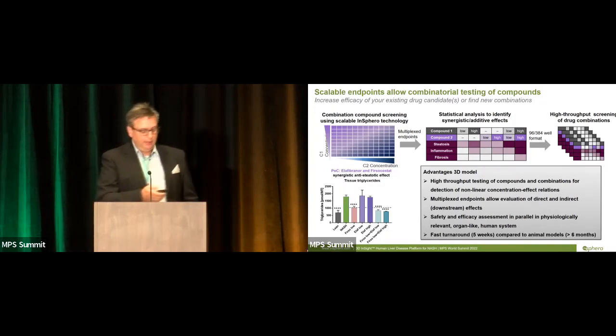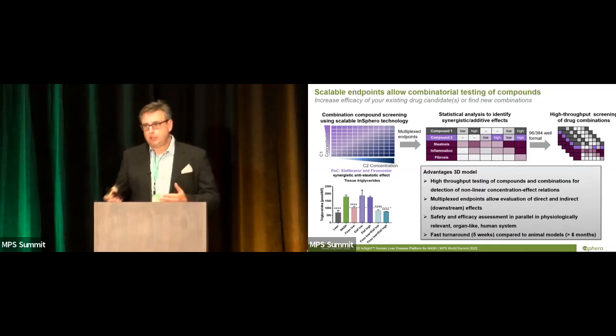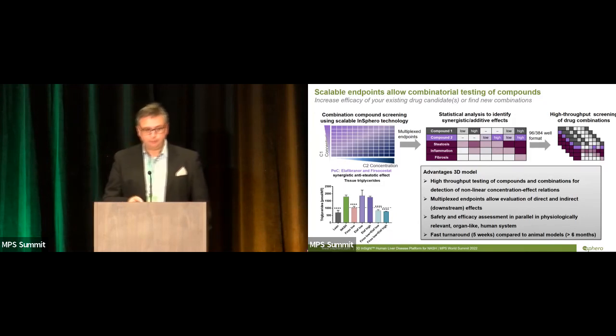You see that each of the drugs, this is control, this is NASH, each of the drugs in itself is not very powerful, but when we start combining the two drugs, we see a synergistic effect by this drug-drug combination. And this, for us, is a way to go, also with other drugs under investigation, to see how we can improve the efficacy by combining them in the right combination.